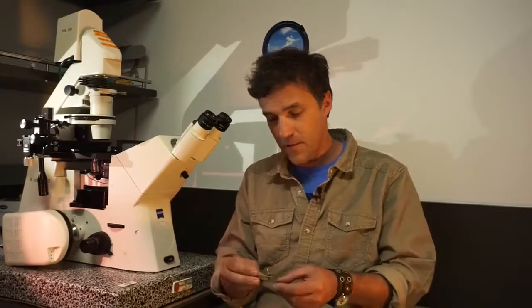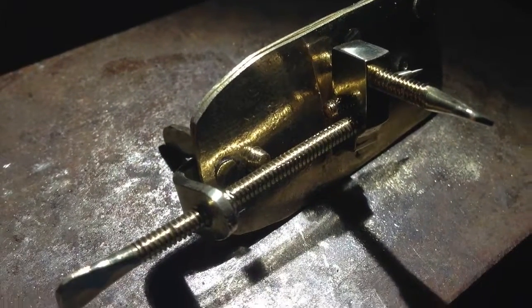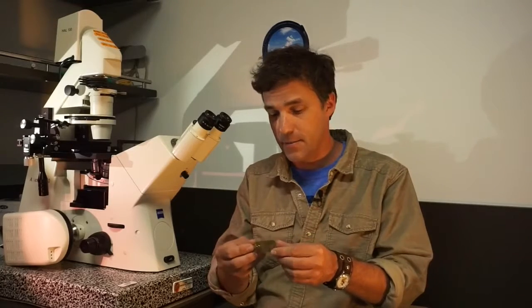Leeuwenhoek's microscopes were actually fairly complex. This is a replica of one here. It's made of brass, has a glass lens, and a sophisticated little mechanism to hold the sample and to focus and so forth. He made hundreds of these, and they're very complex to make. So what we're going to do is make a microscope that functions very similarly, but is a lot easier to make, and is made out of very simple materials. Paper. So you can make your own paper microscope.